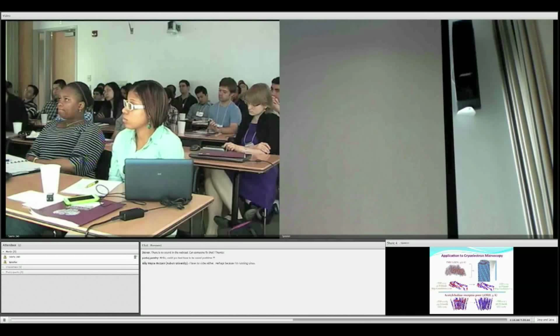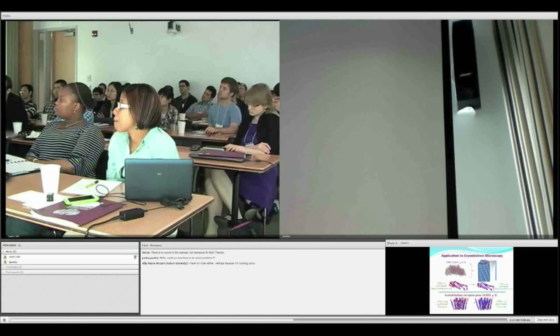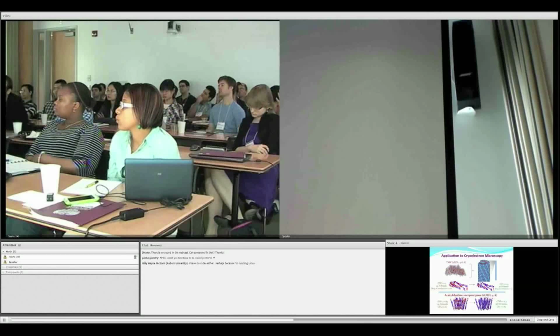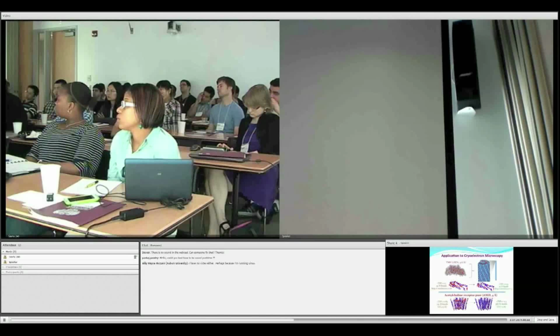This is the data for the HIV reverse transcriptase. This is the low resolution data. This is after TOP, and this is the high resolution data. Here I'm showing the difference between before and after for the phi and psi, and you can see that after TOP, on average, the angles move closer to the high resolution data.